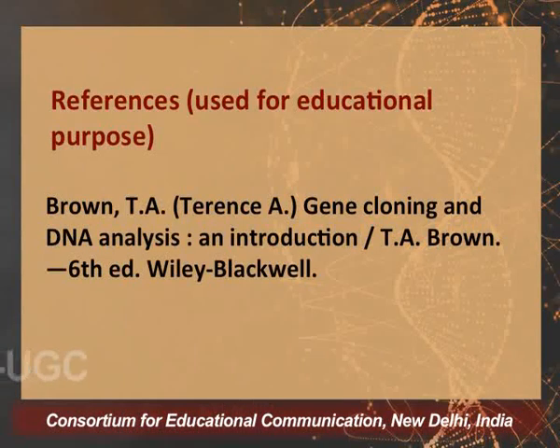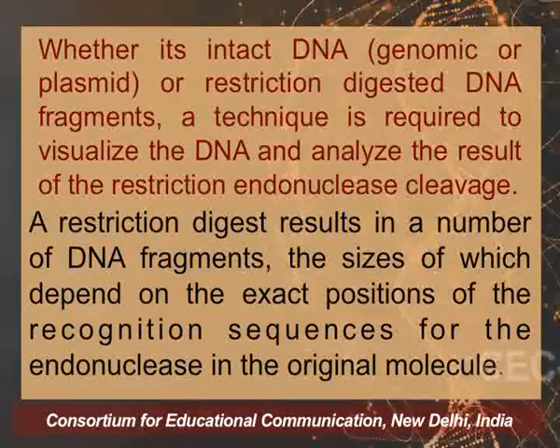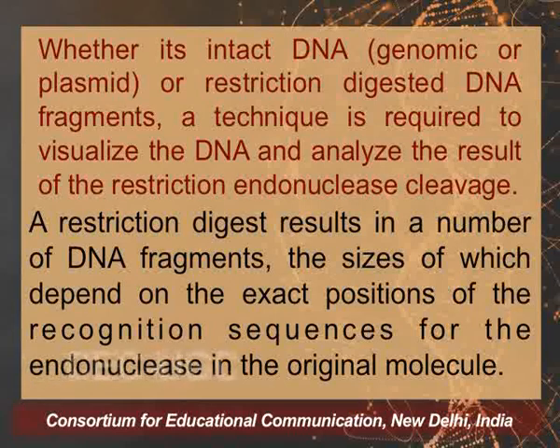The reference which is used primarily for the educational purpose is the book T.A. Brown, Gene Cloning and DNA Analysis: An Introduction, the 6th edition, and it is entirely used for the educational purpose. Now, whether the intact DNA or the restriction digested DNA fragments, a technique is required to see this DNA as well as analyze the result of the restriction endonuclease cleavage.